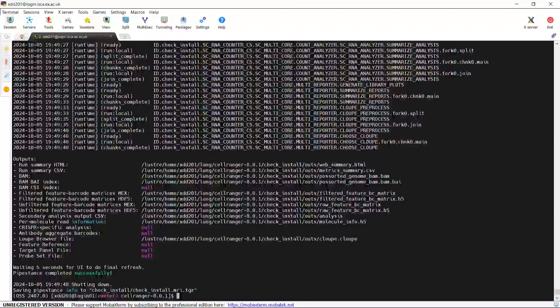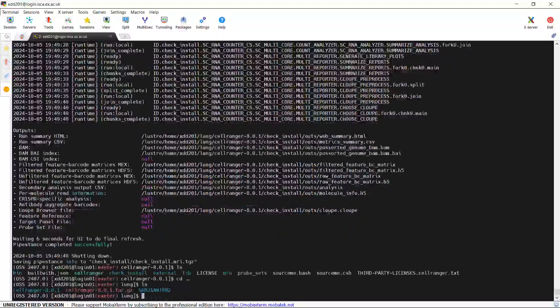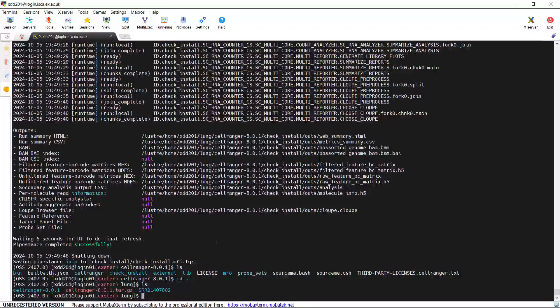CellRanger successfully completed the test run. So for today's demonstration, I showed you how to download the CellRanger software and install it on a high-performance computer, and we also did a test run. You can see the software is functional in my account.